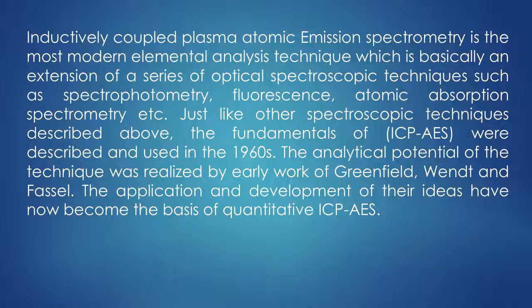The first among them was spectrophotometry, followed by fluorescence spectrophotometry, and then around 1955 came atomic absorption spectrometry. Now it is the era of inductively coupled plasma atomic emission spectrometry. Usually it is also known as ICP-OES, optical emission spectrometry.